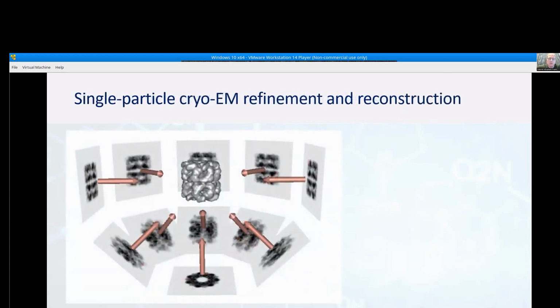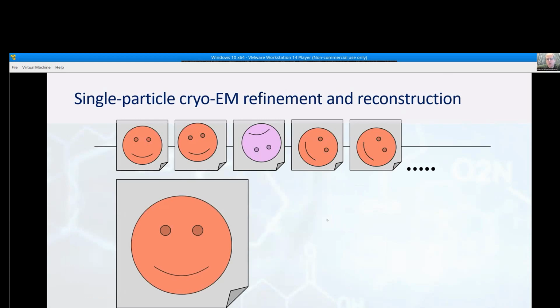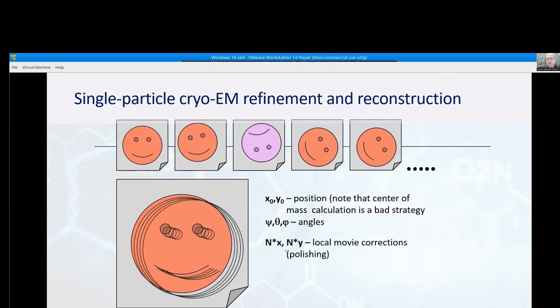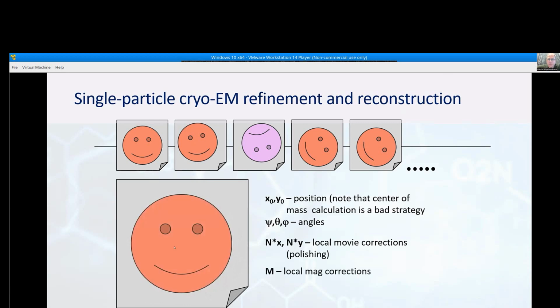So this is exactly what we are doing. In principle, we will need to find the position parameters in shift and space, and in angles, of every measurement that we've done. So in principle, we would like to know where the image is shifted, how it is rotated. In 3 dimensions there will be 3 angles, not 1 angle, and many other things that come from the experimental system that I will not go into, but you can see that the list of fitting parameters is getting larger and larger as you want to get to better structures.